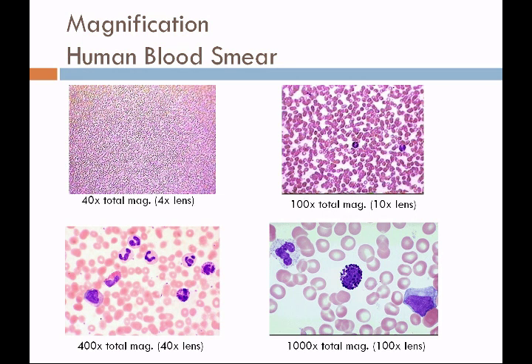At 100x total magnification, you can see the red blood cells, which are purplish red in this image, and the white blood cells are stained a dark purple color. When we magnify to 400x total magnification using the 40x lens, we get much more detail. You can see different types of white blood cells: a segmented neutrophil, banded neutrophils, an eosinophil, a basophil, and a monocyte. These are all red blood cells, and those tiny little specks are platelets.